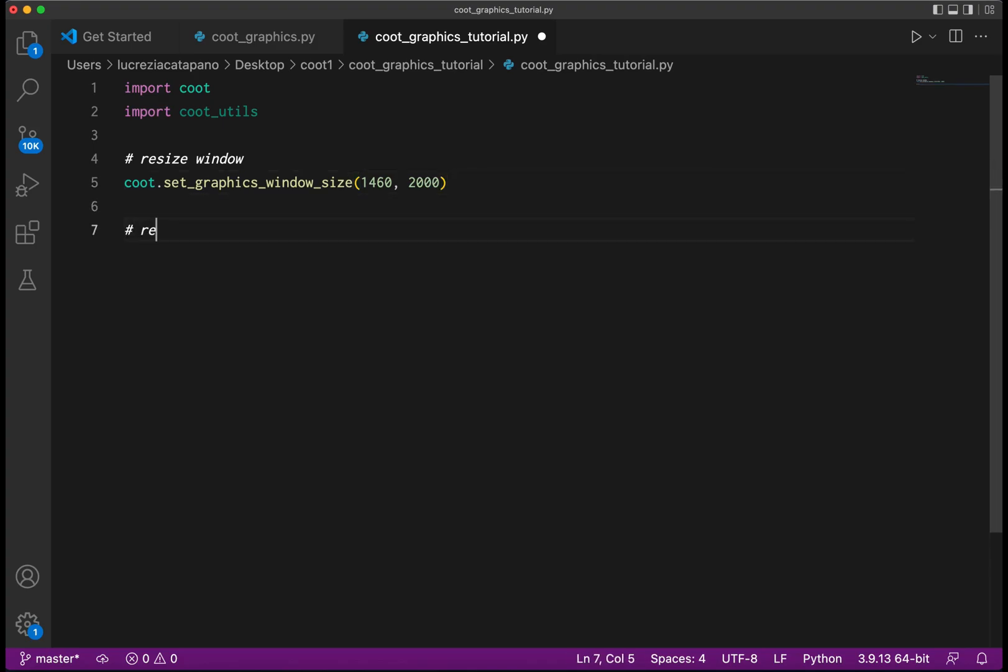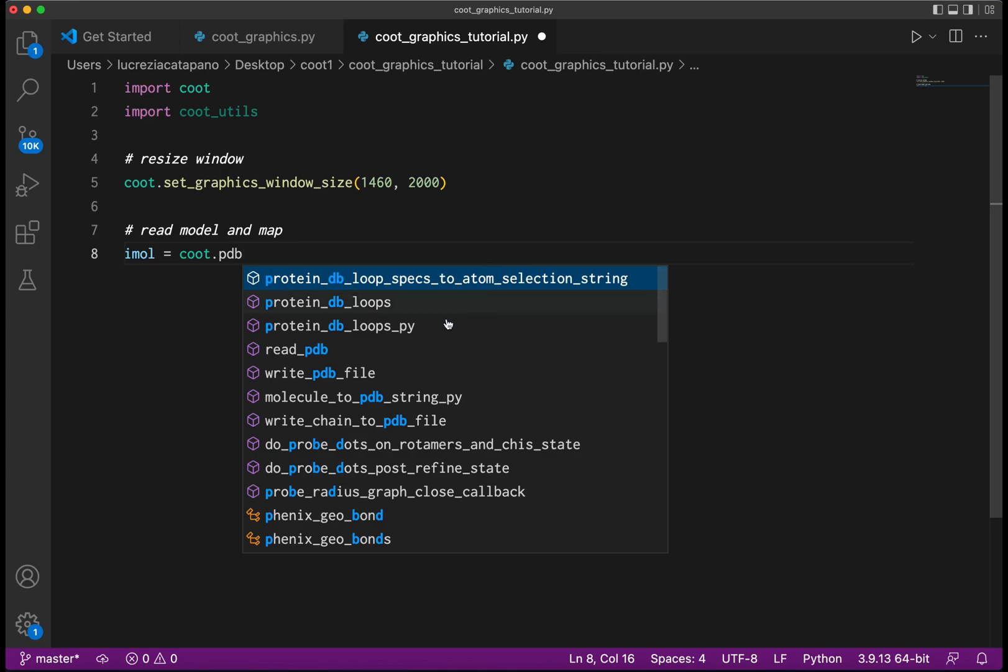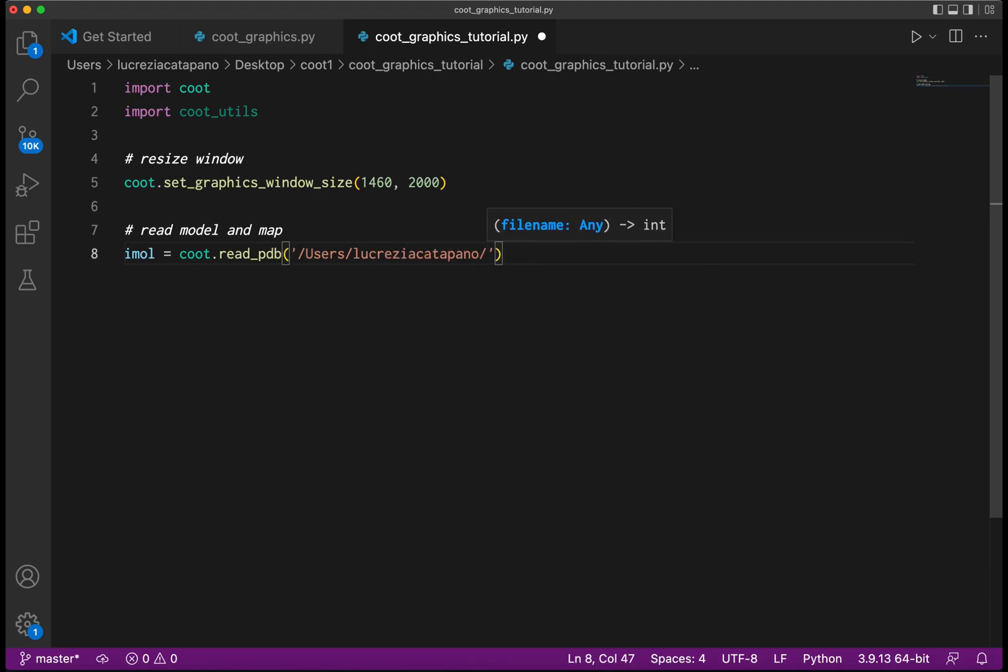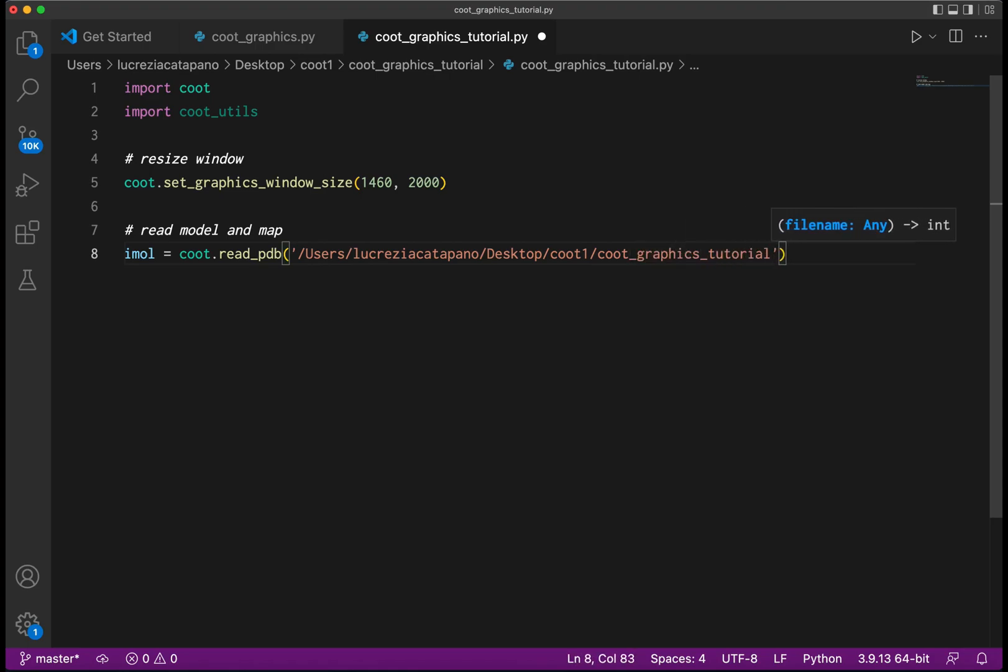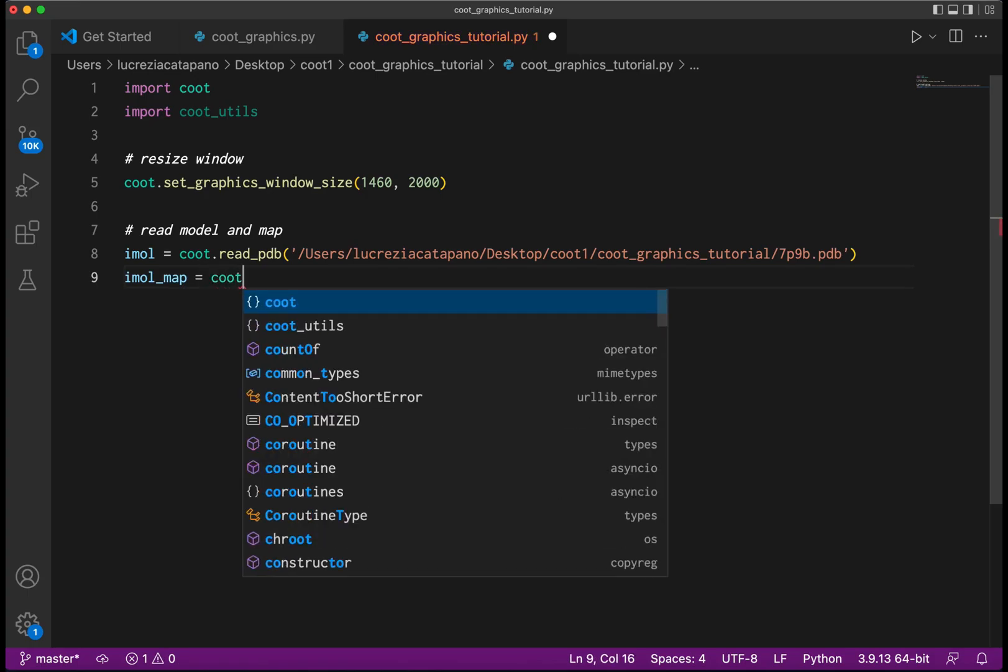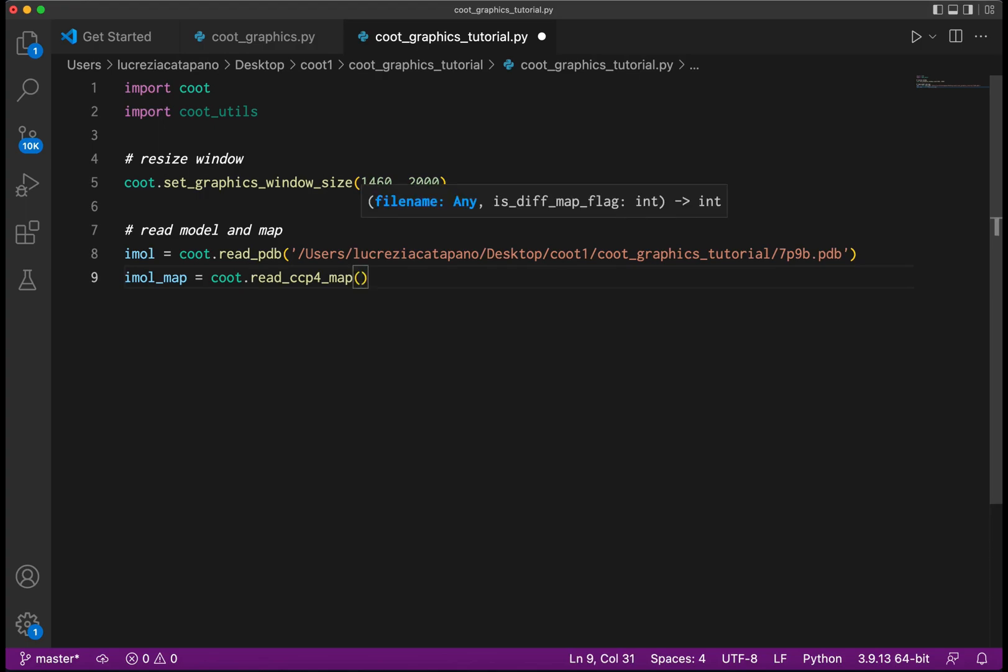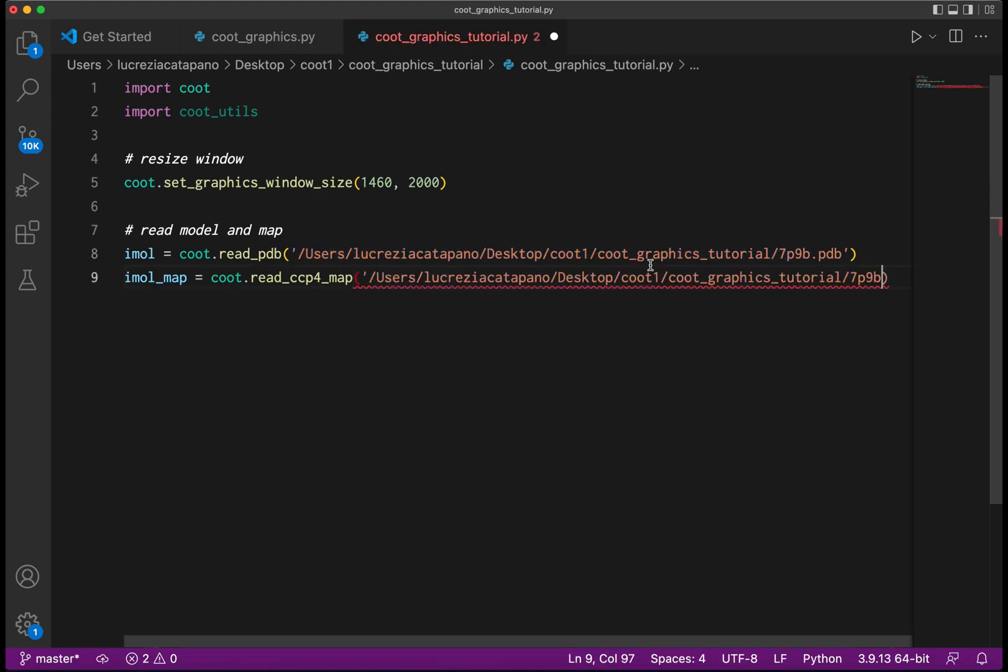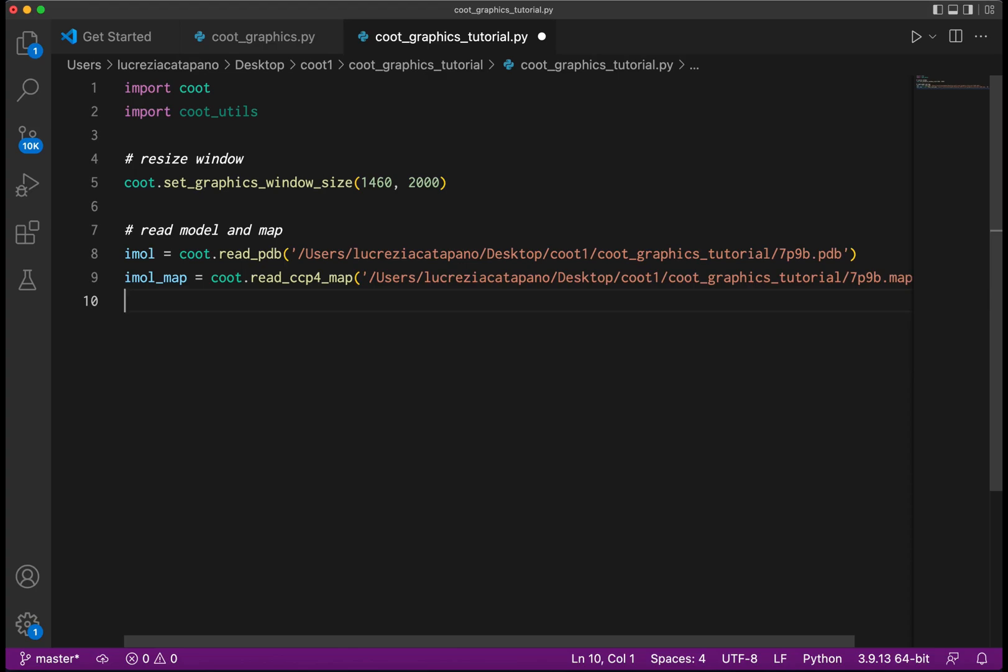Now let's read in the model and the map. We will capture the molecule index of the model in the PDB as imol. This is a very conventional input script. I'm going to give it the full path where my PDB file is. Likewise, we capture the index of the map molecule using the full path, and the zero at the end tells Qt that this is not the difference map.